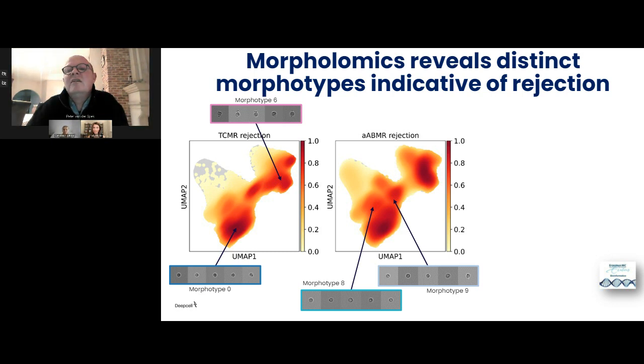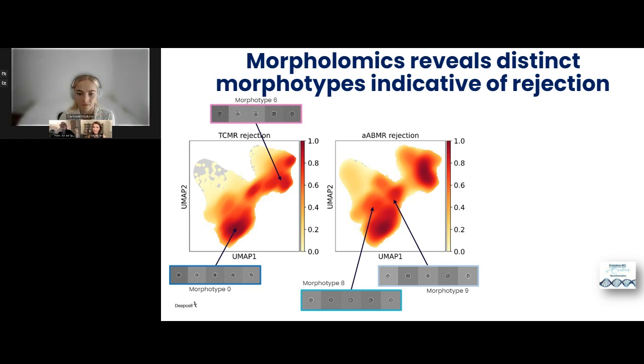It's bizarre. So you see things the pathologist never saw before. But we have no idea. Maybe the pathologist looks at 7 or 8 cells and then he needs a coffee and goes to the next patient. This platform takes a pool of 1 million cells and measures 100,000 cells, so your sensitivity is increasing. Of course the platform is going to detect things you can't by eye. So you need AI. Absolutely.